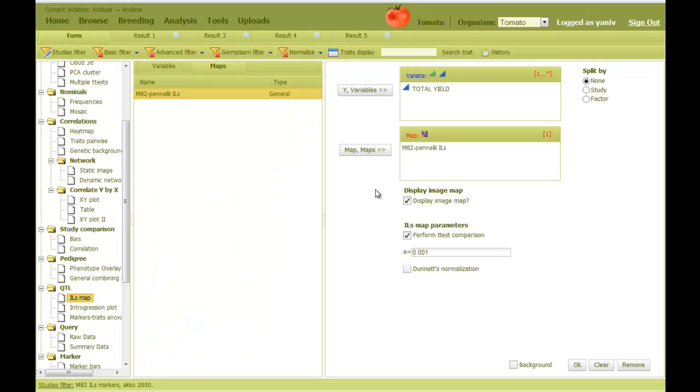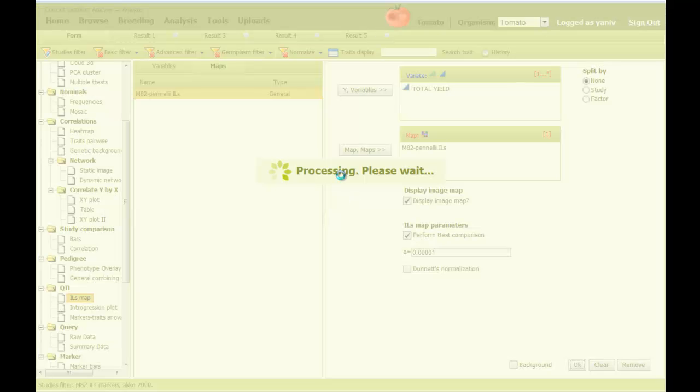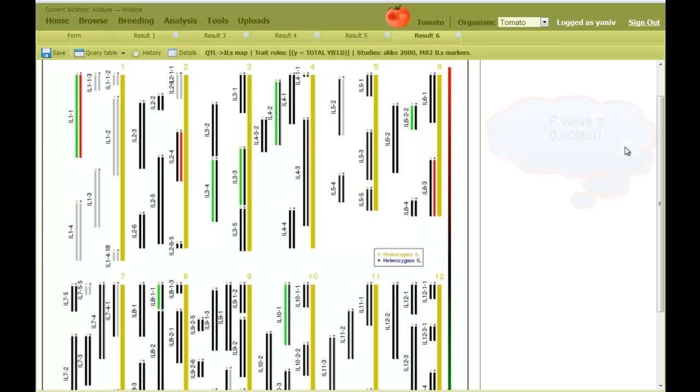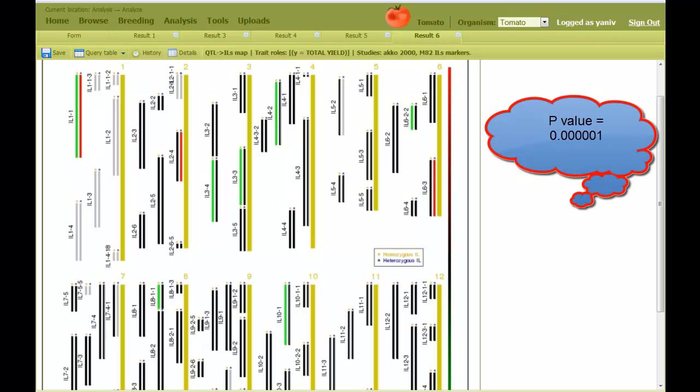As another option, I can set a more stringent p-value while performing the analysis. Let's make it this one. Now we have more black segments instead of the colored ones, which indicates less significant differences.